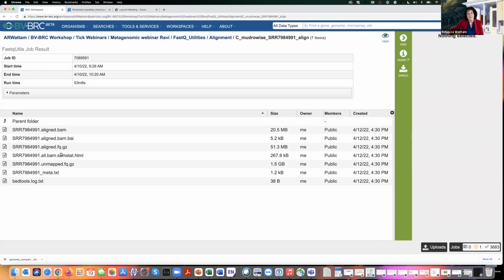Then I could use these reads that were aligning to that genome. What would actually probably be more useful for you, but not for the ticks. Actually, that's the best way to do it because we don't have the tick genome, and that's the easiest way, I think, for you to do it. Does that answer your question?